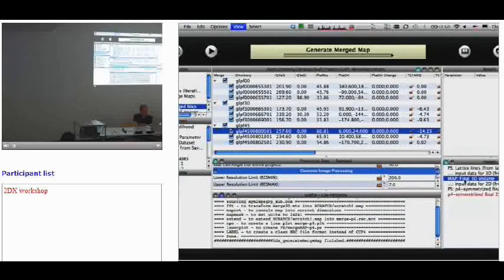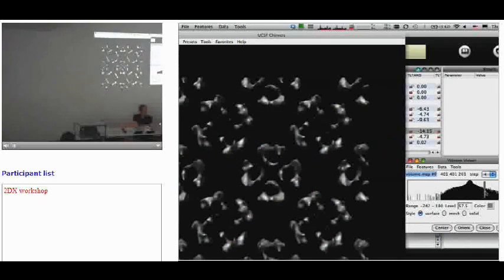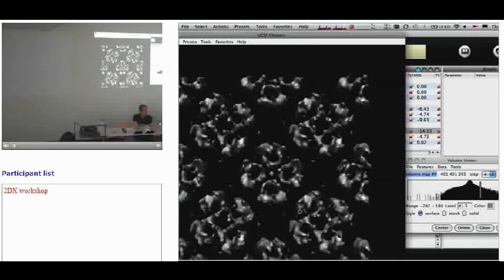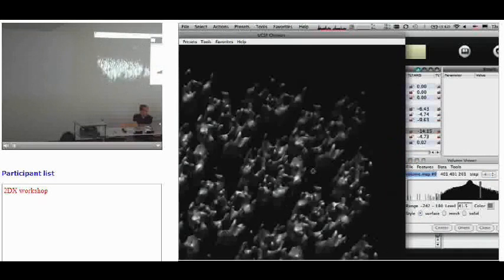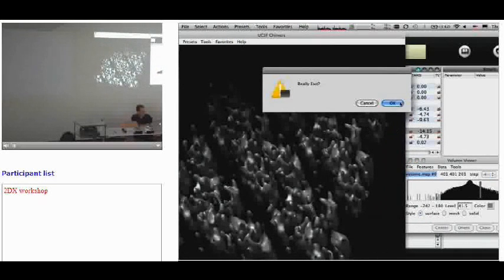So there is the 3D volume. And if I double-click that, I open it in Chimera. So now this little computer is supposed to open Chimera. And this is 6 tilted pictures, and it's not great, but it's technically working.